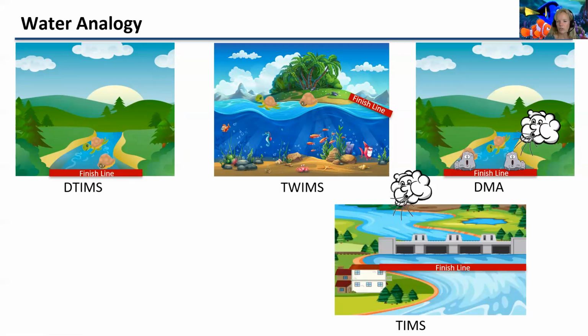Now if we think about trapped ion mobility, this is where we have the gas flow pushing the turtles, or our molecules, down, but then the electric field is basically pushing them up. In this case, I have them being stopped by the dam, but the electric field is pushing those molecules up, and until we start ramping it, we don't get the molecules out. Here Garfunkel is actually getting pushed more by the gas flow and Simon less, and then we're going to ramp open the gate to the dam, and Garfunkel will probably get out first.